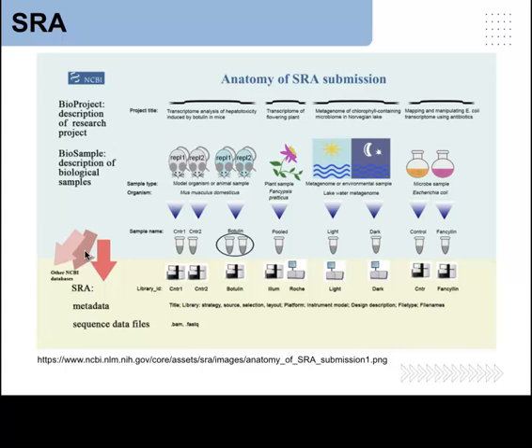The SRA is going to contain information on the library, sample, and the instrument, and is directly associated with the sequencing data. The samples, the SRS, can actually be shared between different studies, and thus they can be deposited into the database by multiple submissions. Each experiment, that is the SRX, is unique for the specific sample.